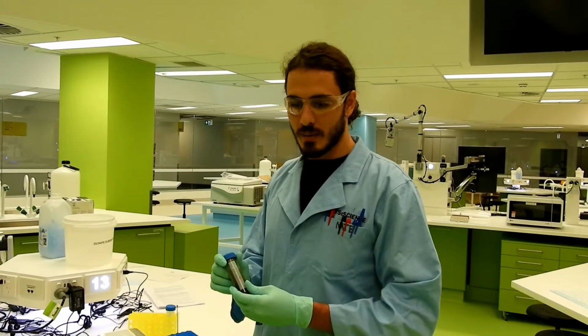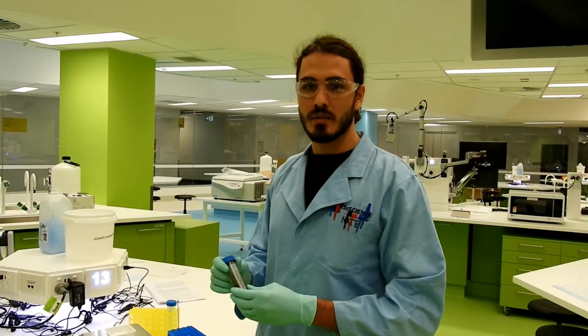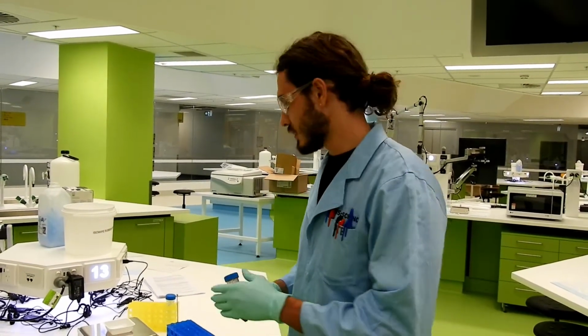First, we need to weigh a known amount from our sediment sample using a laboratory balance. Today we'll be measuring 0.3 grams for our DNA extraction.